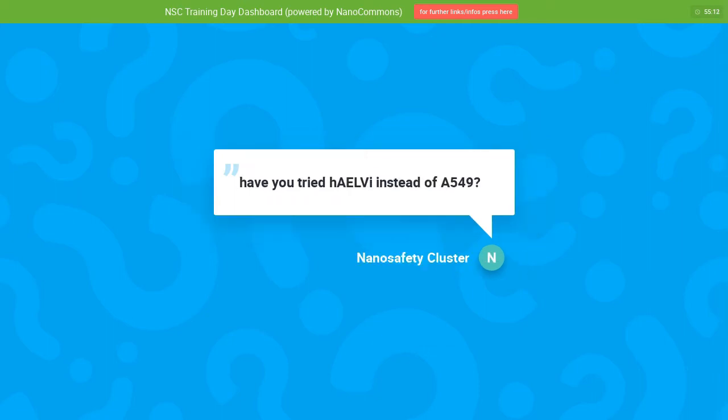That's a very good question. Also, one of our other Patrols partners has been looking at the Calu-3 cells instead of the A549 cells. Not within Swansea, we focus purely on the A549 cells.